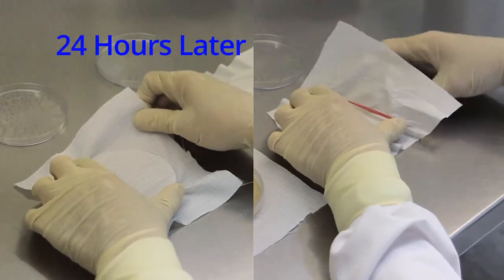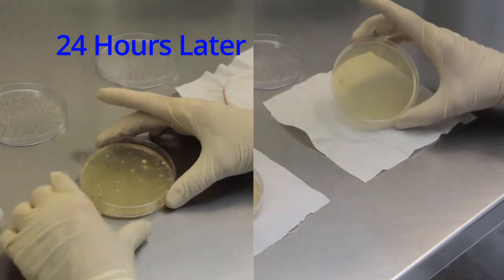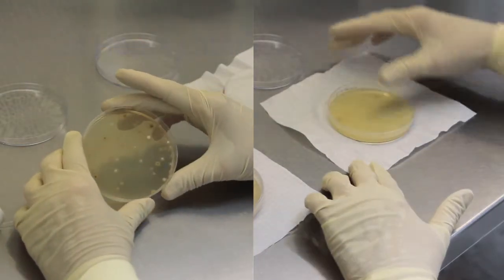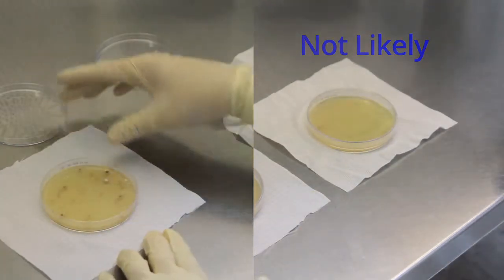The final problem with the test method is that the petri dishes are not incubated. This would make it very unlikely that colonies would grow sufficiently in 24 hours, as shown in the reenactment.